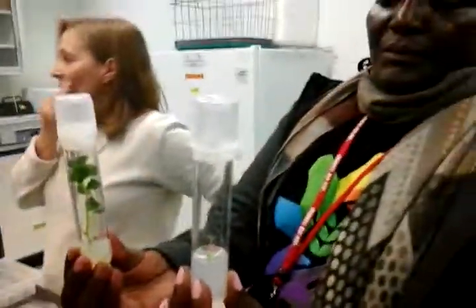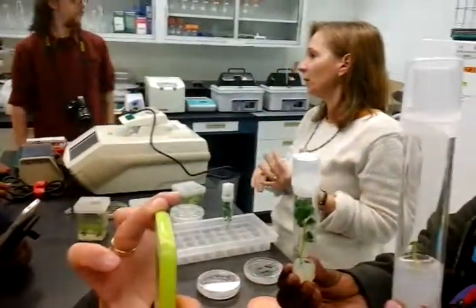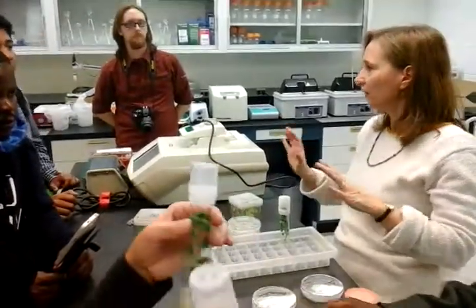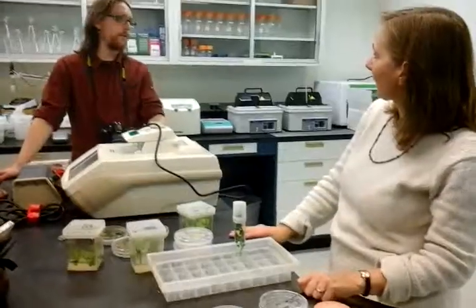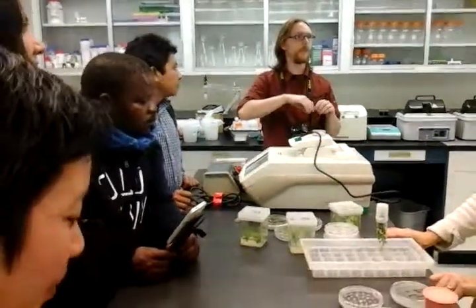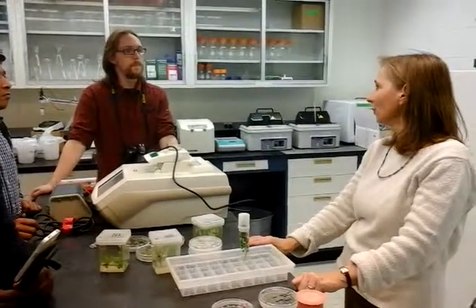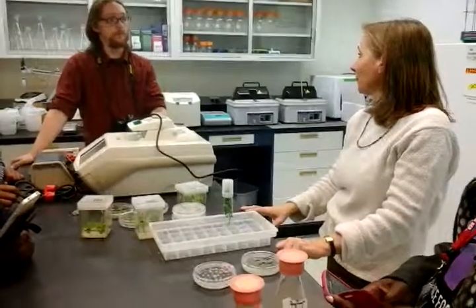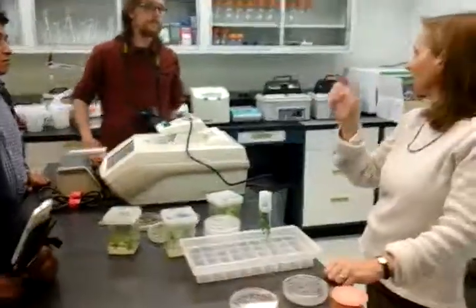How many different media do you work with? Not a lot, but we have so many different species — potato, tomato, grape, milkweed, and more — and they all have their own protocol. I'm also working with peppers. We had to work out the transformation first, which took a really long time. Right now we have really good preliminary data that the transformation is working, so now we can start introducing genes. We're using the agrobacterium strain ABI for those — it's a placeholder commercial strain.